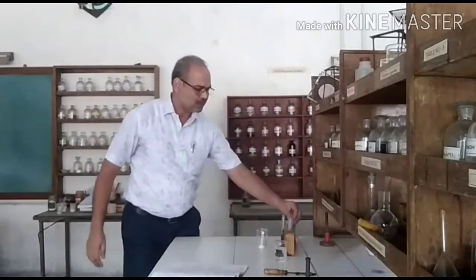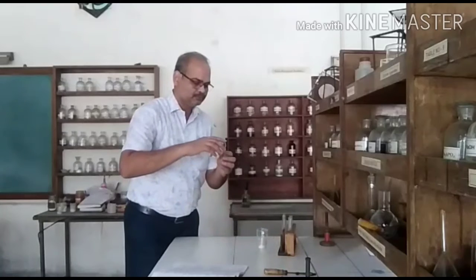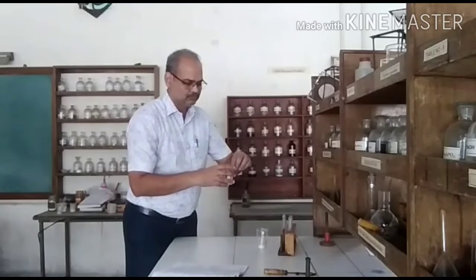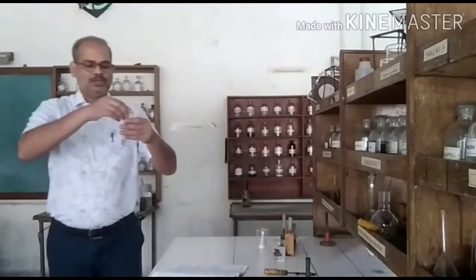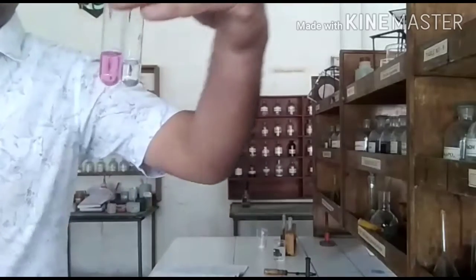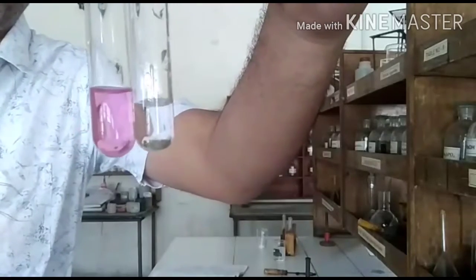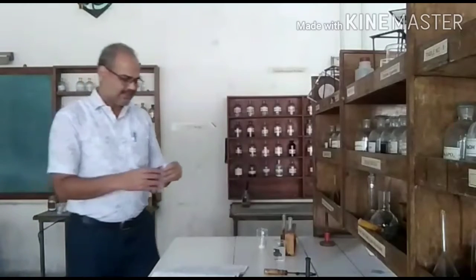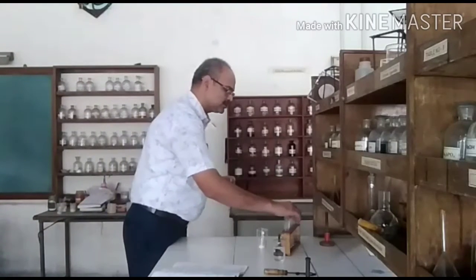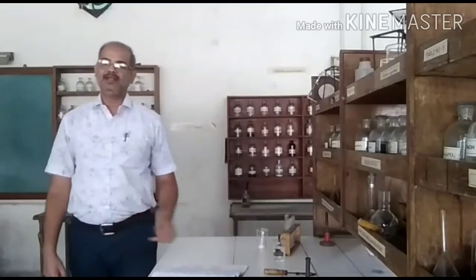Now to clearly visualize the pink color, in another test tube I will take little water, hold the test tubes together, see the pink color. Now it is very clearly visible. Since you have got pink color, the Ct for CO3-2 is successful. That means whatever first acidic radical we detected is confirmed.